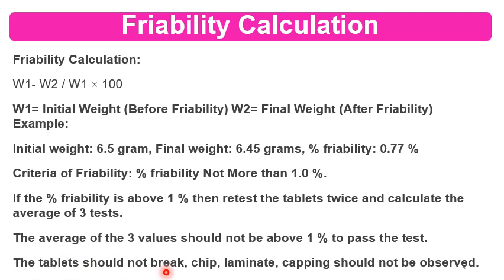The tablet should not break, chip or laminate, and capping should not be there during the friability testing and after. If capping is there, your friability test will fail, or sometimes the friability test is discontinued because of capping, and the core tablets are required to be verified again for the compression process, the manufacturing process and also the composition.